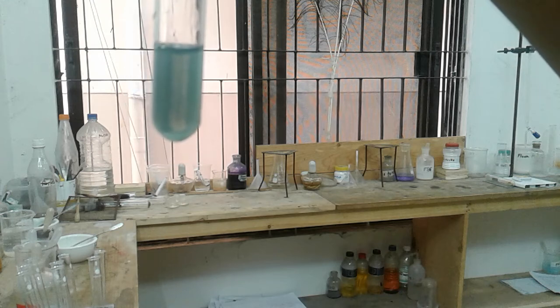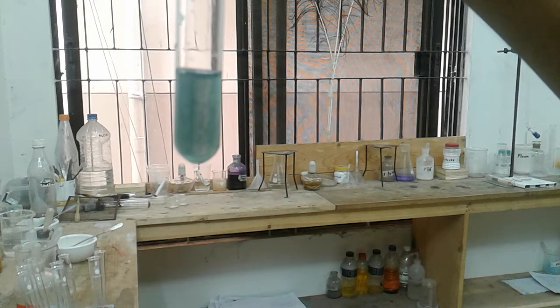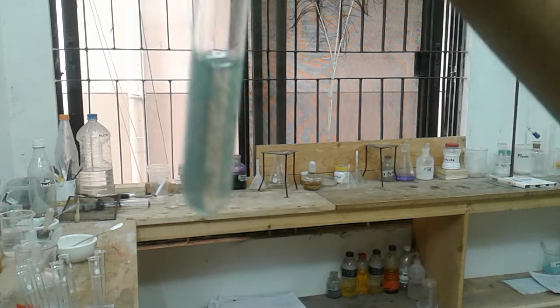Look, it's a dirty green precipitate that we have obtained. Now we are adding excess. So let's add some more.